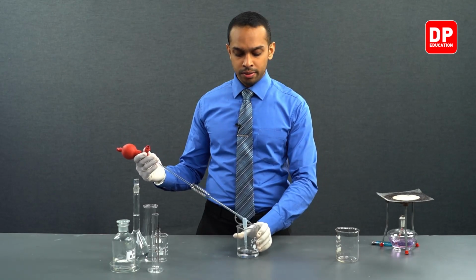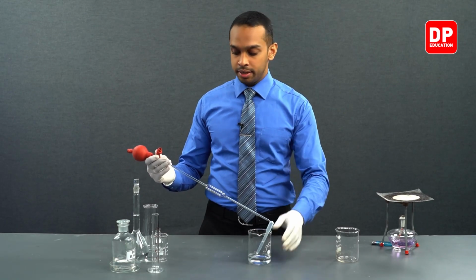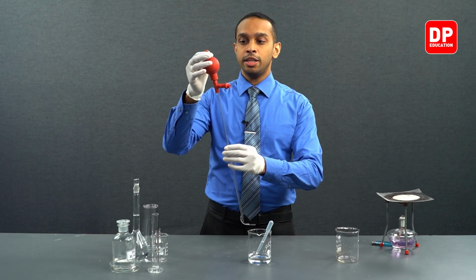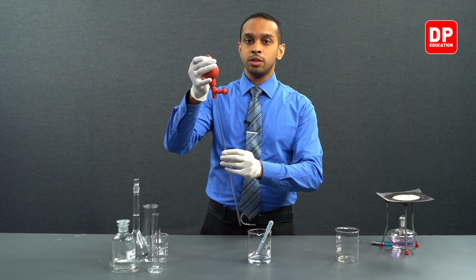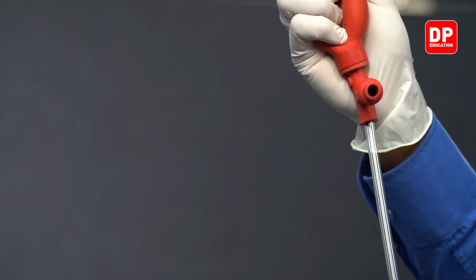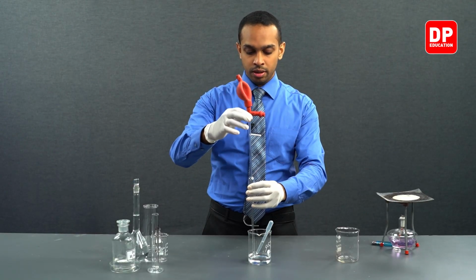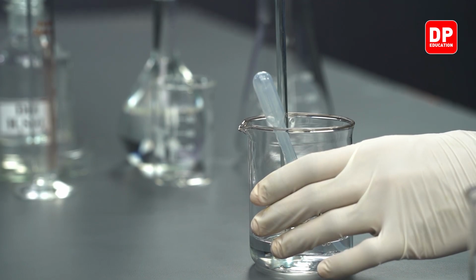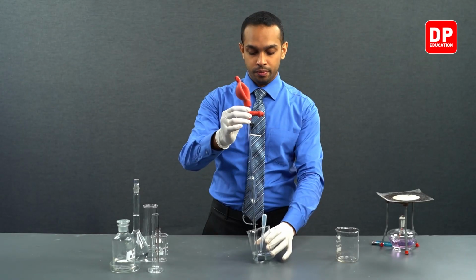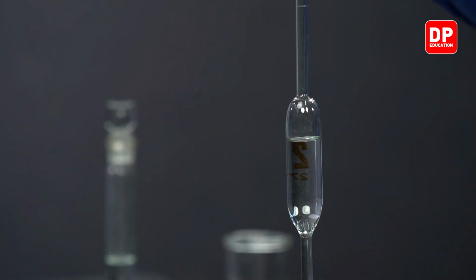Here we have our distilled water. We will take our pipette and use a pipette filler such as this one, and we will press the topmost valve over here and squeeze the pipette filler and try and take in a little bit of water with the use of the second valve that you have over here. As you can see, when I am pressing it down, the pipette is getting filled with water.